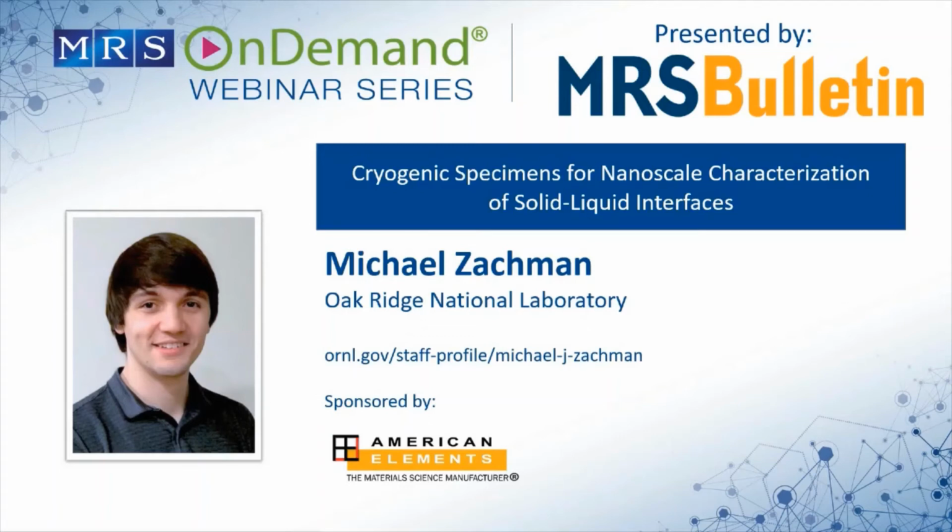Right. Yeah, so you hit on it. The word stable is the key one there, because we can technically go all the way down to liquid helium temperature. All you need is a dewar that you can put liquid helium in, and a holder that has a dewar for that. So right now, I would say the lowest that you can do stable enough to work basically how you would at room temperature without major changes is liquid nitrogen temperature, and you can get within 10 or so degrees of it with these standard cryo holders.